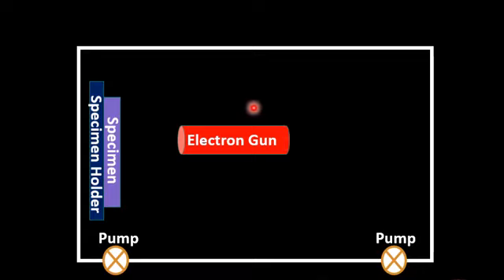Student, please note that inside the Auger electron spectroscope chamber there is an electron gun. I have some other lectures on the electron gun, and you can follow those lectures about its construction, how the electron gun is constructed and what the different components of the electron gun are.